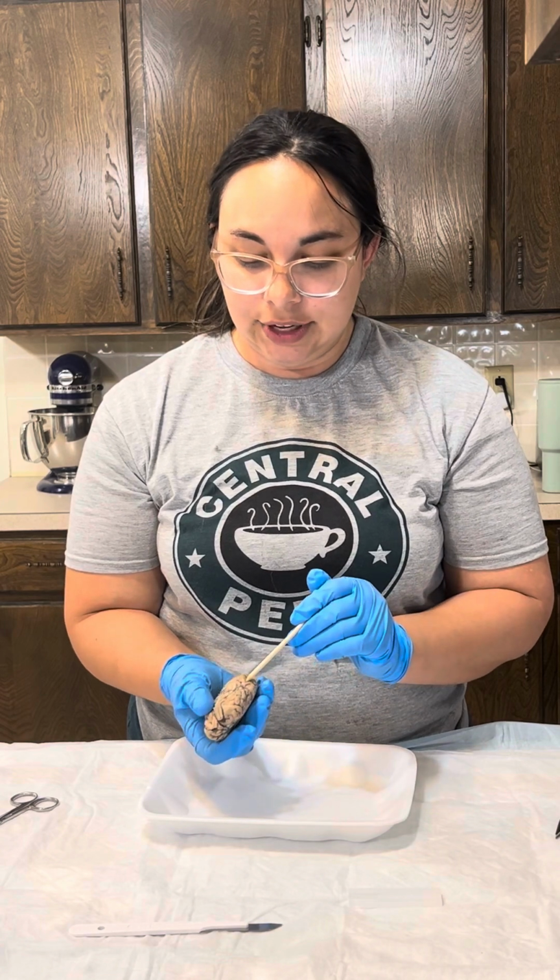That's the parietal. Back here is the occipital, and that has to do with your vision. If this is damaged, you can suffer from vision loss. And then down here, you can kind of see them if we look into this fissure, right here and right here are your temporal lobes.